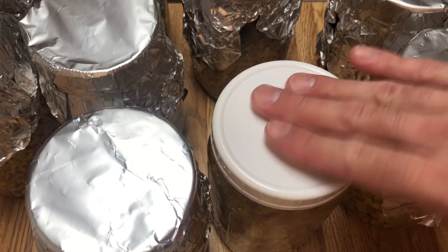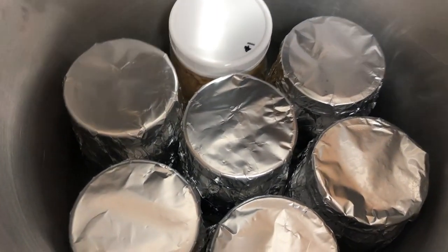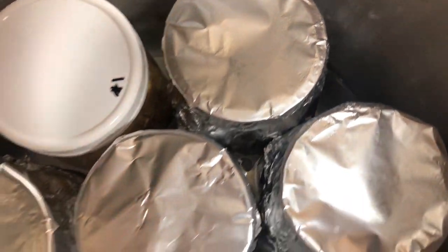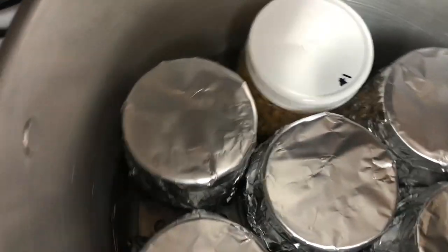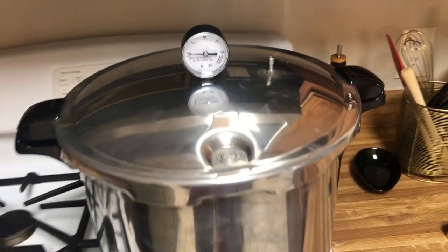And also, you don't need tinfoil on this. You can use tinfoil on the unmodified jars, but you don't need it. I'm not going to use it. I'm just going to throw it in the pressure cooker and let it go. Now we have our jars in our pressure cooker. You probably can't see this, but the water line comes almost halfway up the jars. I'm gonna put two more on top so I can fit 9 total. And then we're gonna get going.